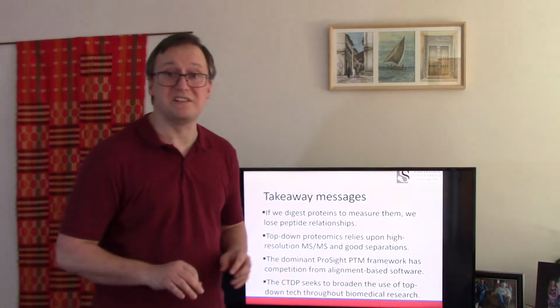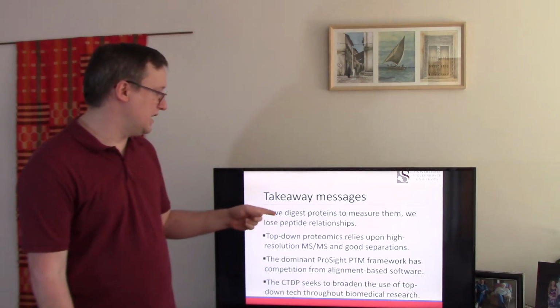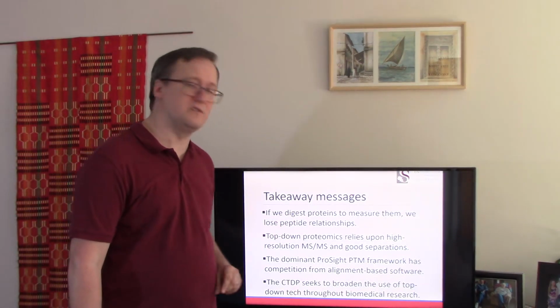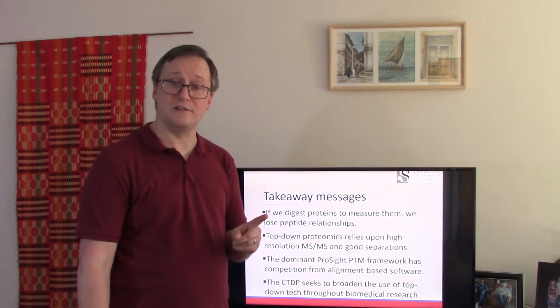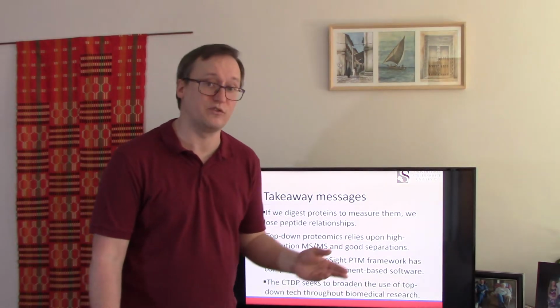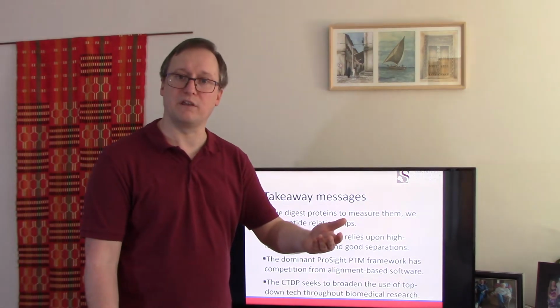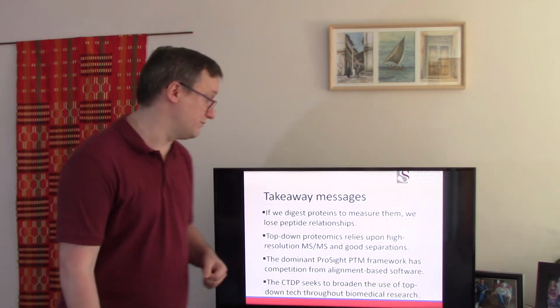There are lots of pieces to this talk, so I'm going to try to walk through some of the biggest points. If we digest proteins to measure them, we lose peptide-peptide relationships. That is a really big loss, and just because this is the way things have always been done does not mean that this is how we'll do things 20 years from now. It may be that top-down is ready for the breakthrough where ordinary labs would opt to go this direction.